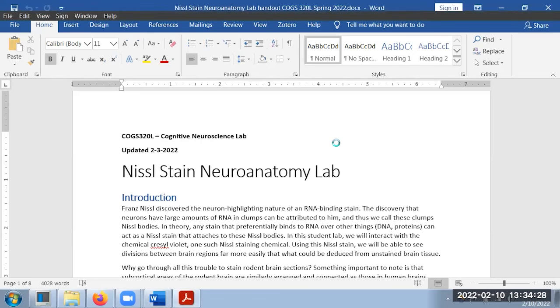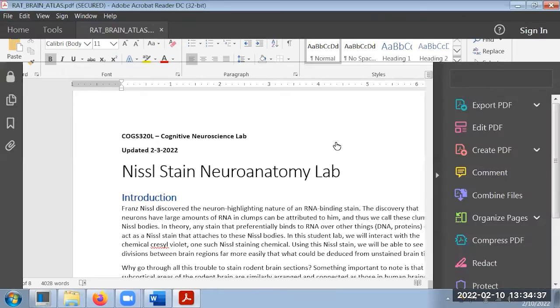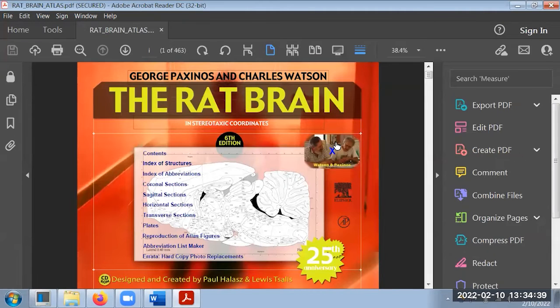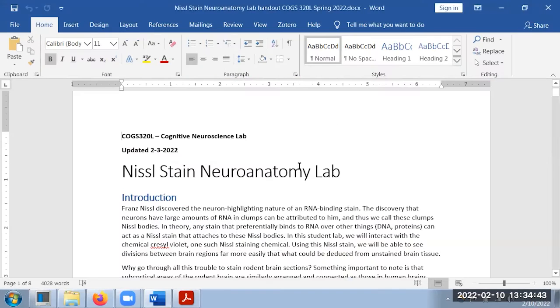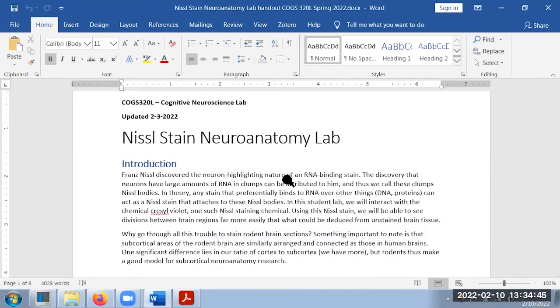In this session, we're going to be starting off with some stuff having to do with Nissl stain. Now, I know we talked a decent amount about it in class at this point, but we do have a few refreshers that I want to go over. And so I just want to put out some reminders.